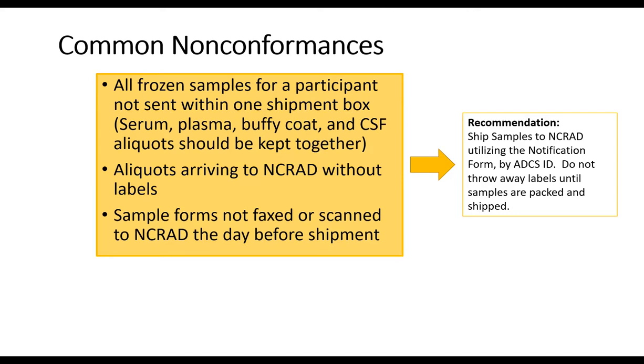Please make sure all aliquots are labeled. You'd be surprised how many times we receive unlabeled tubes, even though we provide all the labels in the kits. And then also please provide the forms in advance of the shipment.